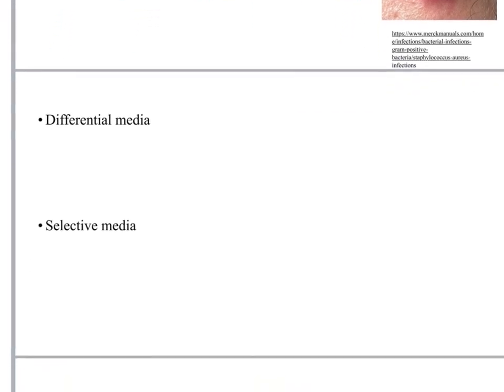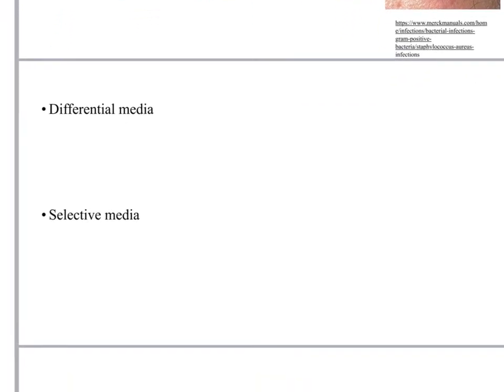Let's talk briefly about different kinds of media in general before I talk about what you're going to be inoculating. Okay, you may have talked about this in lecture a long time ago. I want to highlight the difference between media that's considered differential and media that's considered selective. We've worked with a lot of differential media, or some examples of differential media so far.